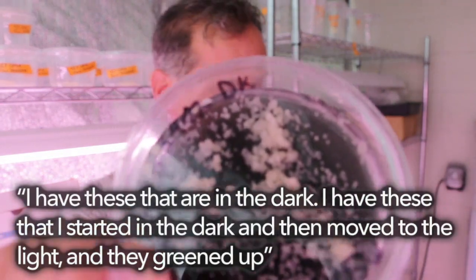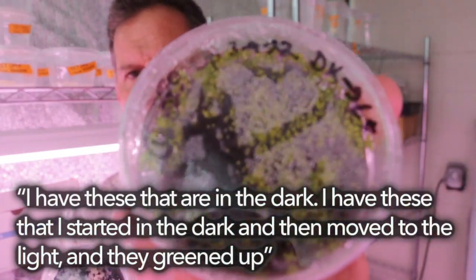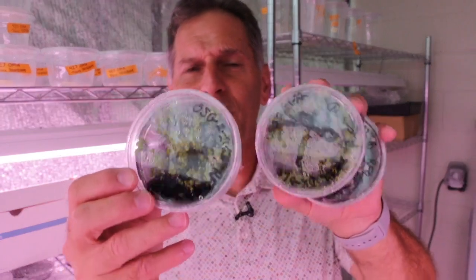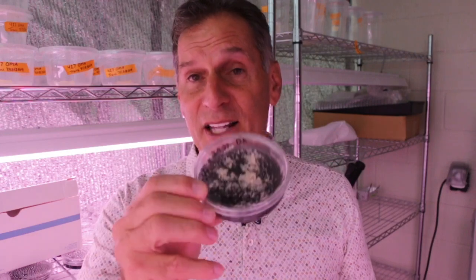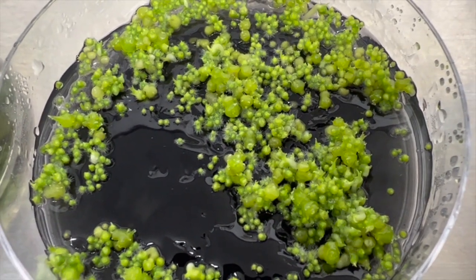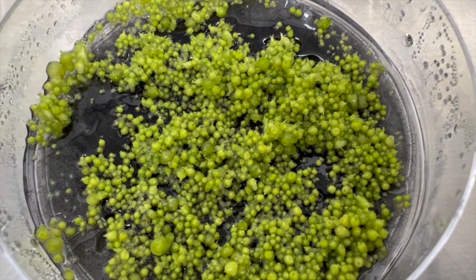So I set up the experiment exactly that way: seeds started in the dark then moved to the light, and they greened up and are fine. Then I also have seeds germinated directly in the light with no dark treatment at all. Looking at these seedlings underneath the microscope, I don't see any meaningful difference. If anything, the light-grown seedlings are more developmentally advanced than the dark-grown ones. So in my hands: dark-grown, dark-transferred-to-light, and light-grown all perform the same — if anything, the light treatment looks better.